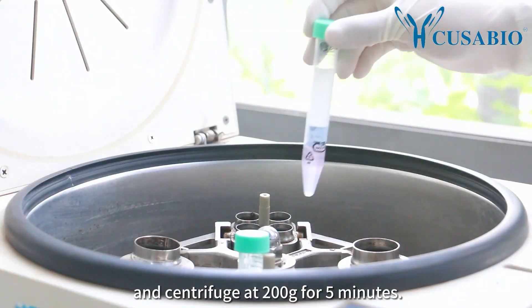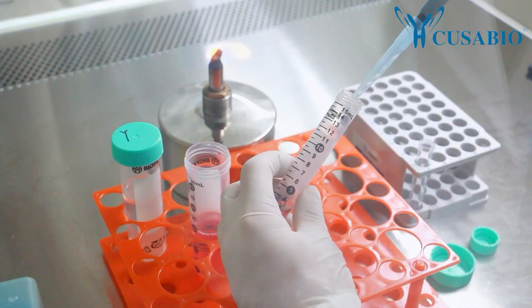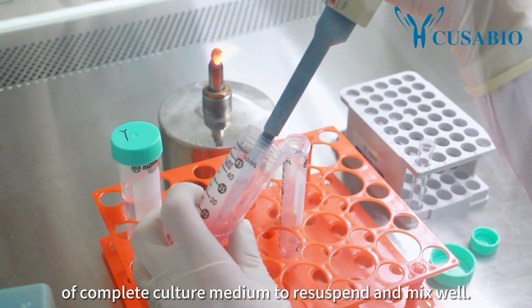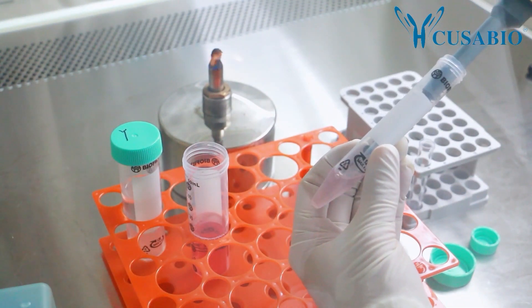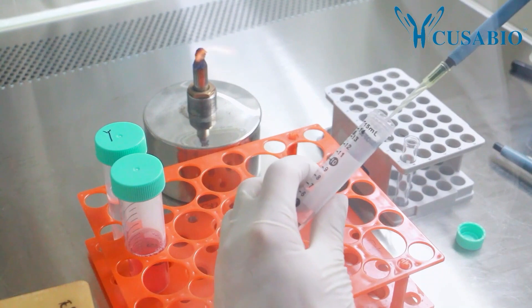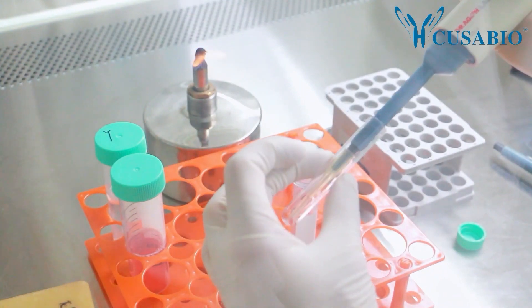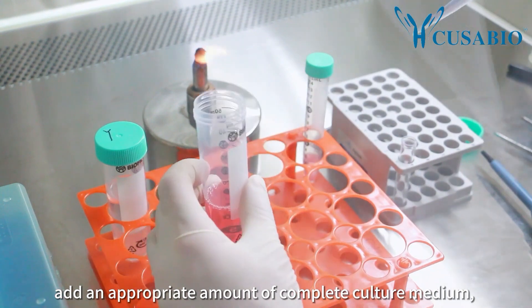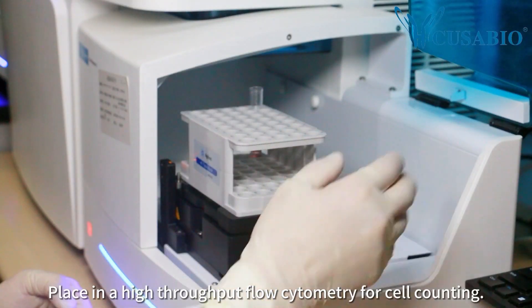Centrifuge at 200 g for 5 minutes. Discard the supernatant after centrifugation and add 2 milliliters of complete culture medium to resuspend and mix well. Take 50 microliters into the flow tube, add an appropriate amount of complete culture medium, dilute and mix well, then place in a high-throughput flow cytometer for cell counting.